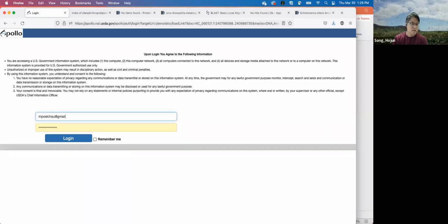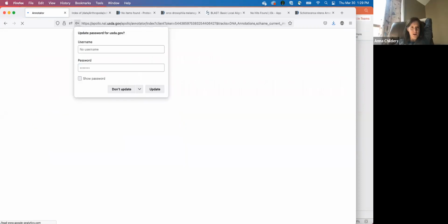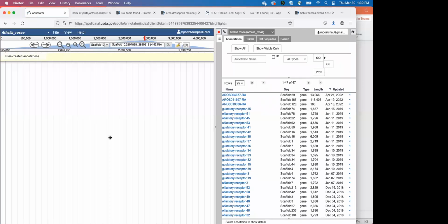Well, no. Oh, it doesn't anymore? Okay, maybe old on this. I thought that there used to be, but okay. Yeah, so that's part of the problem with the new setup, and that's why I was directing you towards using that.